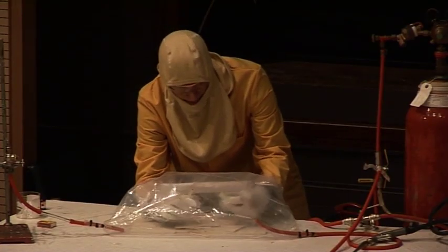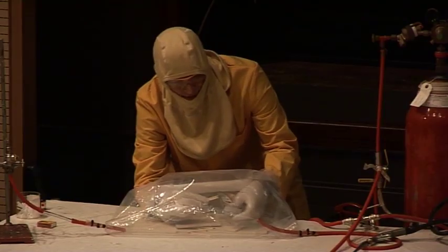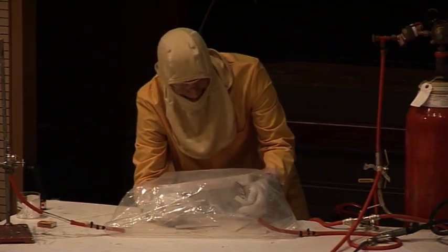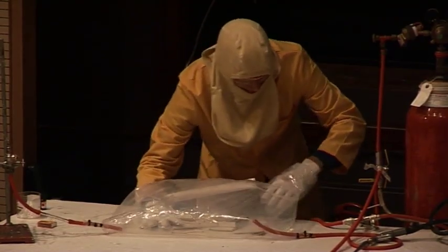So the matches do light, and this is because the matches contain all the oxygen they need built into them, but, phew, I always get slightly nervous, but the hydrogen doesn't light, and I think I'll quit while I'm ahead there.